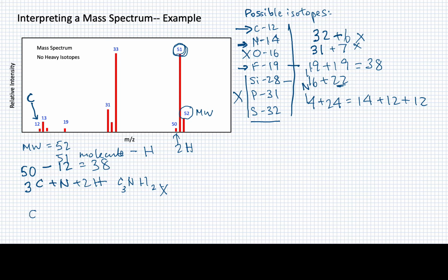I've got a carbon, I've got 2 hydrogens, and I have 2 fluorines. Does that work to make a molecule? Well, I can imagine drawing a Lewis structure that looks something like this. I've got a hydrogen, a fluorine, and a fluorine. And I haven't drawn this very carefully here, but you get the idea. What I'm going to have is basically a methane type molecule that's got 2 fluorines substituted for hydrogens. So this is my leading candidate for the molecule that would make this mass spectrum.